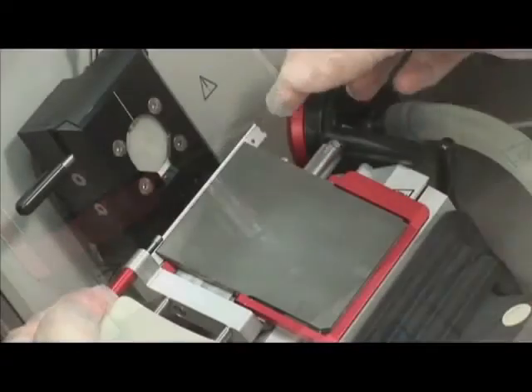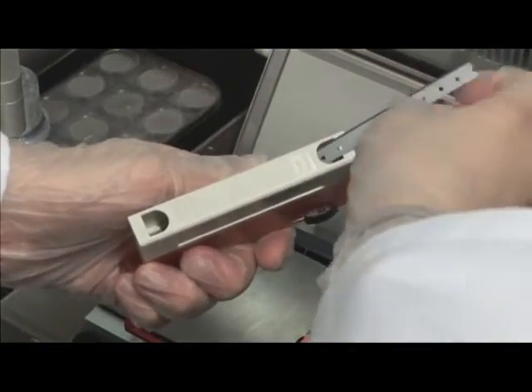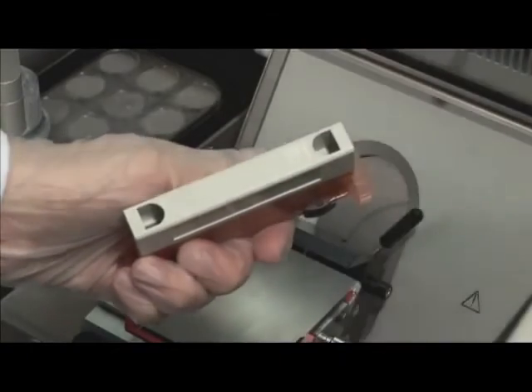The new removal aid enables the user to safely remove the blade from the blade holder CE and dispose of it.